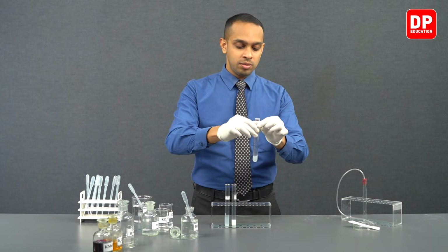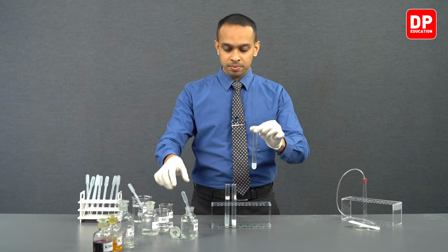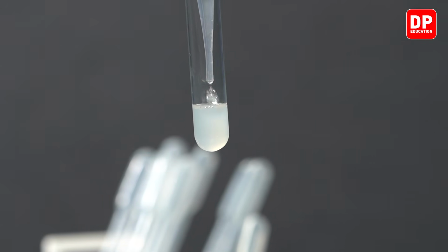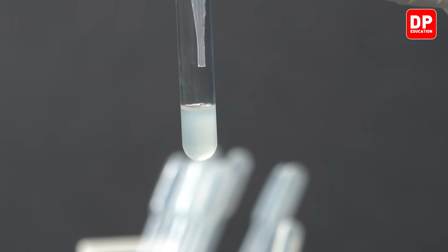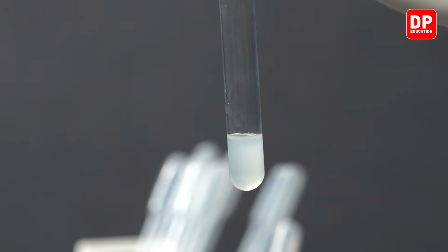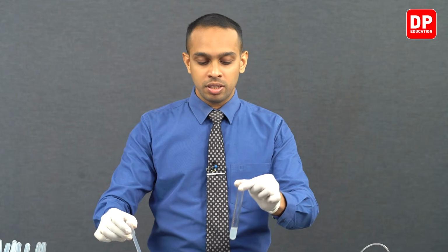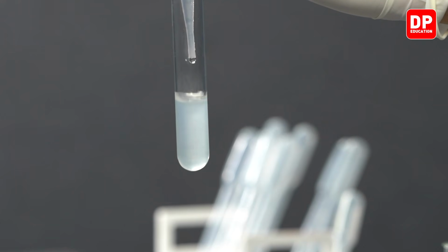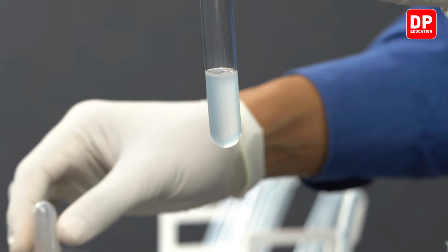If I shake it, you'll be able to see it a bit more clearly. Let's add a bit more HCl. You can see as the HCl droplets enter the medium, the color of the solution is decreasing. Can you see, as the HCl enters the medium, it is starting to dissolve.